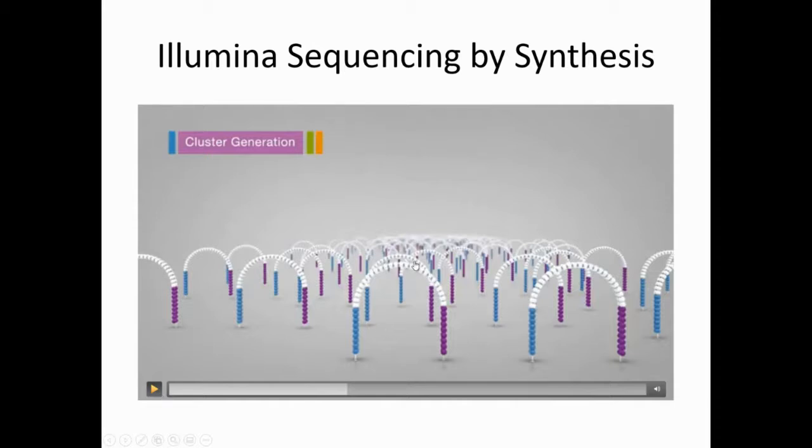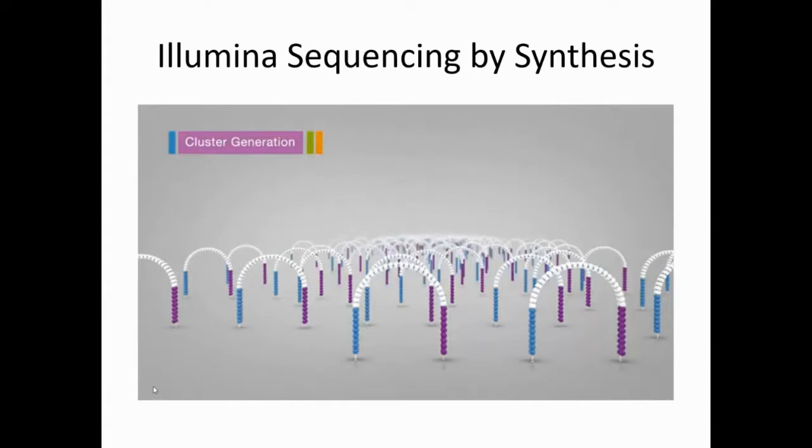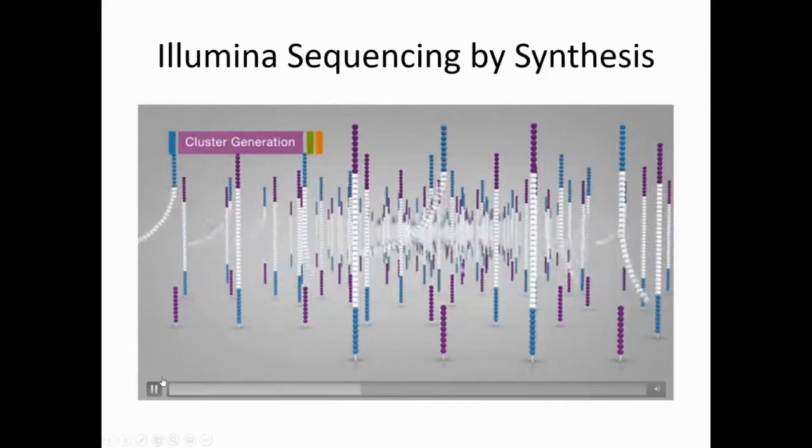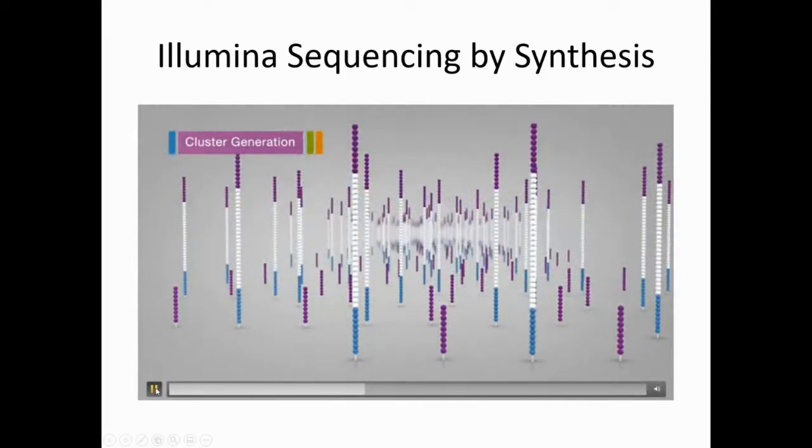So this is just like a PCR reaction to amplify the same sequence, right? Resulting in clonal amplification of all the fragments. And if you have a million different fragments, they can also form clusters at the same time. After bridge amplification, the reverse strands are cleaved and washed off, leaving only the forward strands. So you have the forward strands, all right? Let's say you have 10 different sequences, and those 10 different sequences have been amplified, all right?